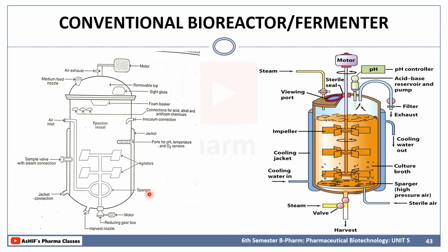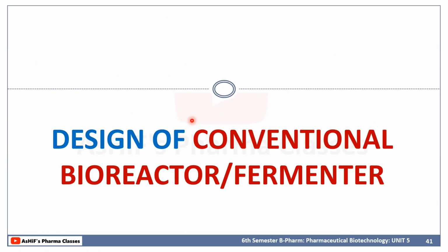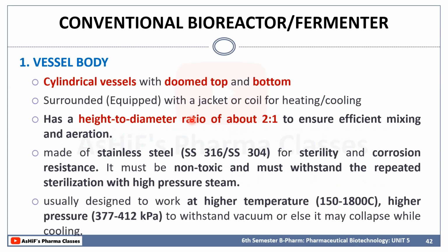So I repeat, whether it is for 2 marks or 5 marks or 10 marks, you must draw the simple diagram of the fermenter. You don't have to go for a complicated one. You have to draw the simple diagram of the fermenter. Okay, so we can discuss the design of a conventional bioreactor.